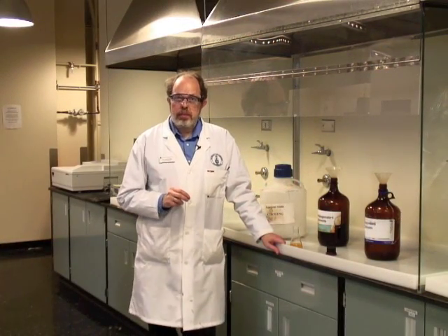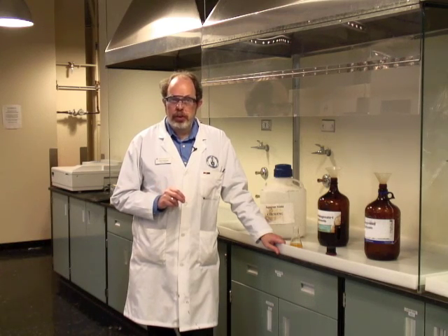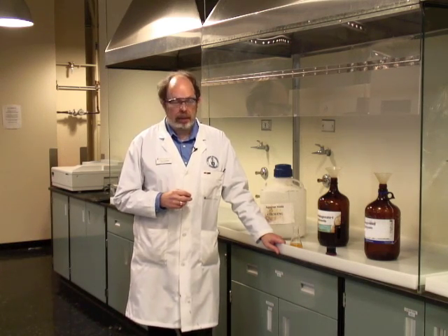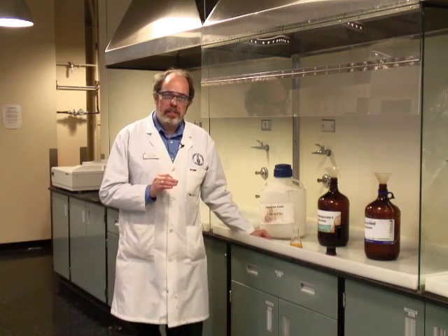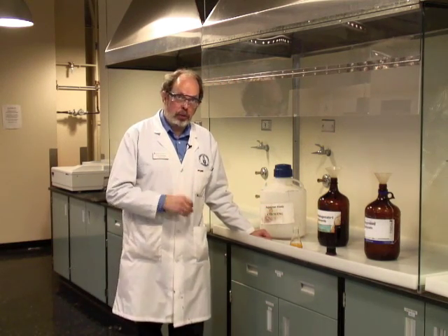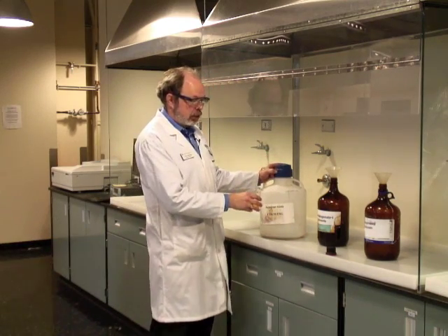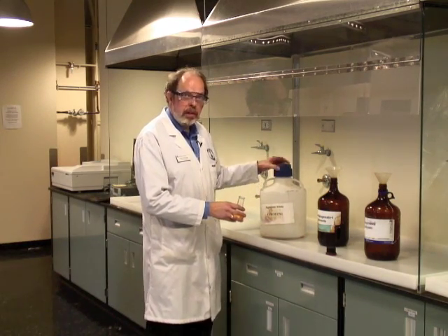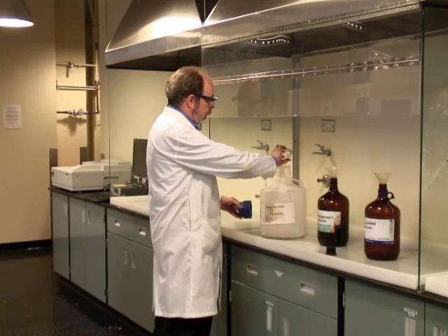One of the best ways to avoid problems with waste chemicals is to make sure that you put them in the right waste container. These are carefully labeled. Make sure that when you're disposing of something you're putting it into the correct disposal place. This is an aqueous solution so it doesn't go into either of the organic ones, but rather into this aqueous waste container.